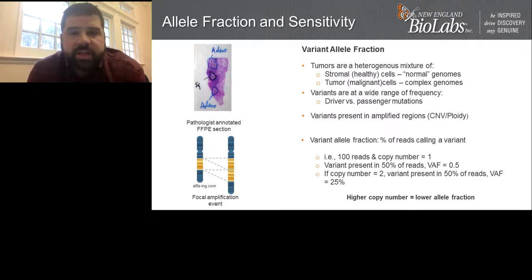And in terms of understanding the depth of sequencing that is actually required to call a specific variant, I typically try to think of a simple formula. If you want to get 10 reads per variant to be able to call it confidently, if you have a 1% allele fraction and you have 100 reads, it's basically going to be present in 1 out of every 100 reads. So, you basically need to be sequencing to about 1,000x to be able to call that reproducibly.